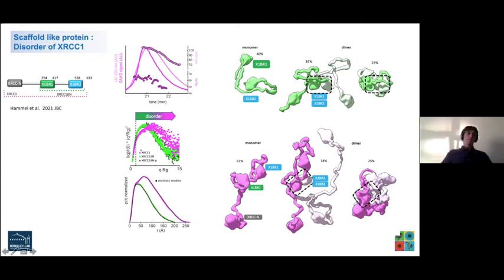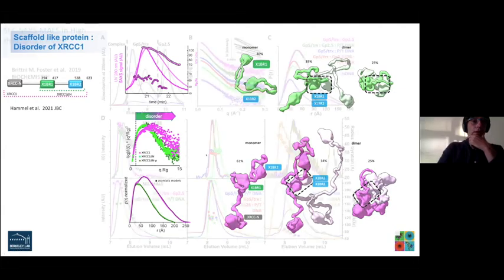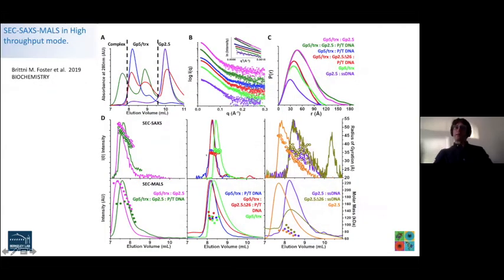Yeah, if I have time, I will show you apoferritin with, I think it was a 20 kilodalton protein on top of it. And you will see it worked pretty much perfectly. Yeah, that was not my data. Okay, I have that. Thank you, Rob. That's useful info. I never tried to have two columns back to back. I think that's worth trying.